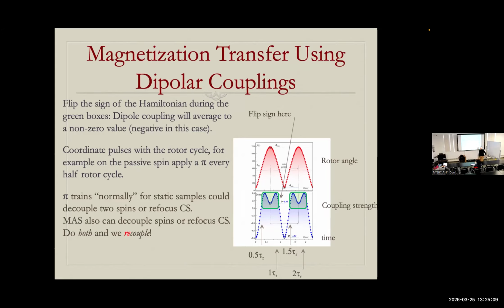Now you say, wait a minute, that's a specific crystallite. You can't really stay on top of it for every crystallite. That's probably not going to work. Different gamma values, different beta values. Okay, but what about a sequence where I just place some pi pulses? Let's just figure out what's going to happen. I have a sequence and I place some pi pulses, and it's a good result.